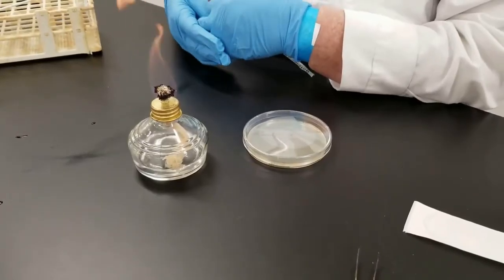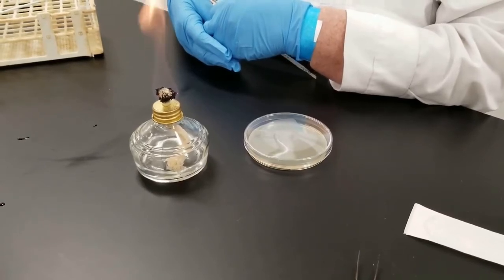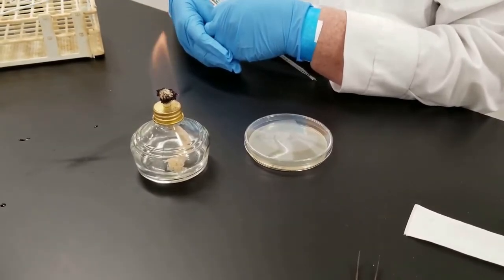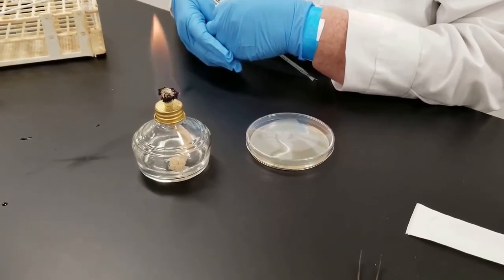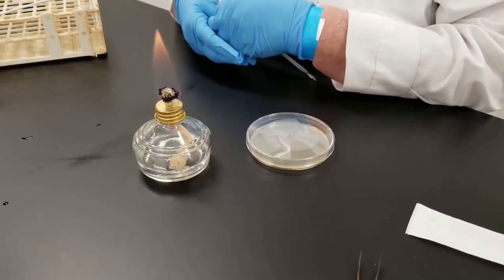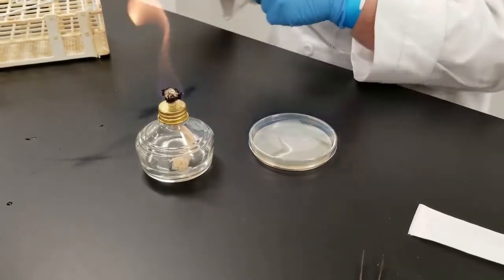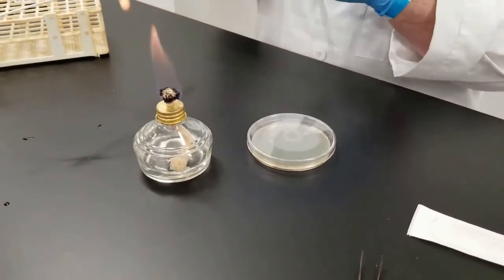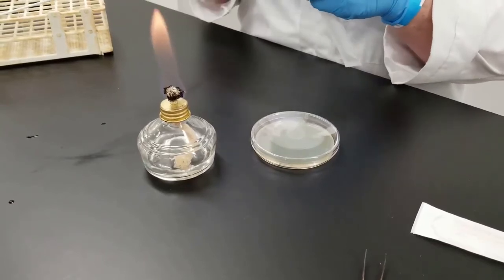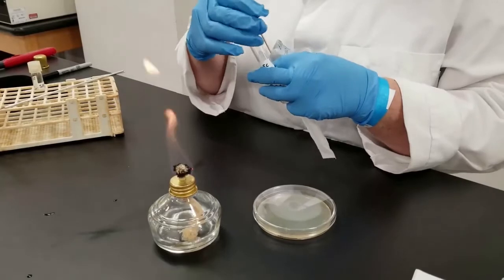In this experiment, we are testing the effects of different antibiotics on different bacteria. We're going to have 2 plates. One will be inoculated with a gram-positive bacteria, which is Staphylococcus aureus. The other one will be inoculated with a gram-negative organism. We will use E. coli. And as I said, we will test the effects of different antibiotics on them.